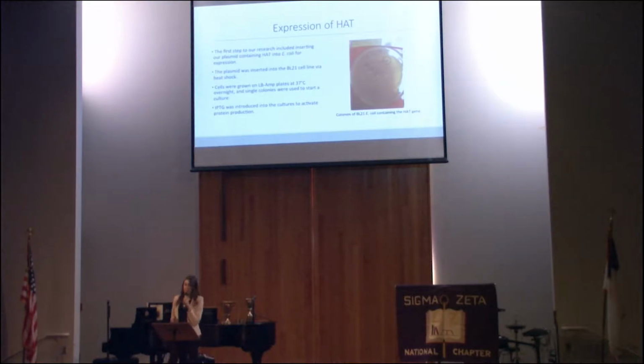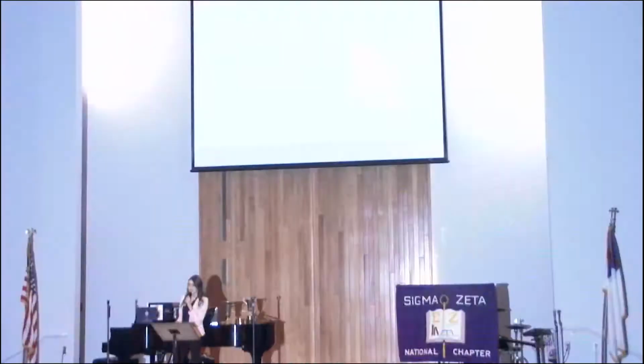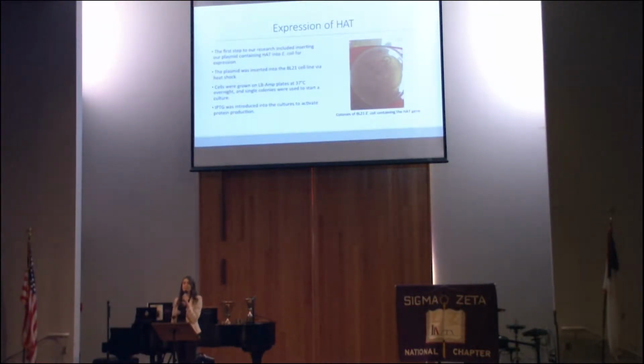So, HAT is a human airway trypsin-like protease. It has some biological functions. It mainly plays a role of inserting viruses into human cells, and this mainly occurs in influenza as well as the SARS-CoV virus. It's also involved in skin cancer, and currently the three-dimensional structure of HAT is unknown. So our first aim was to express and purify HAT, and then go on to find the crystal structure.